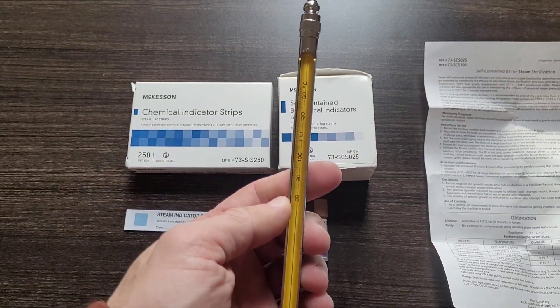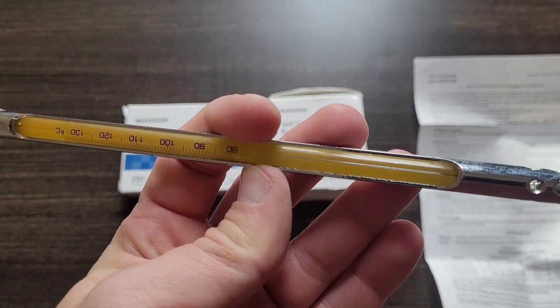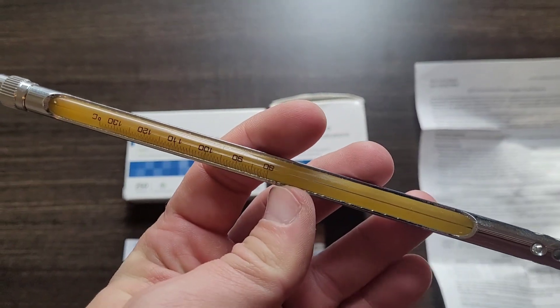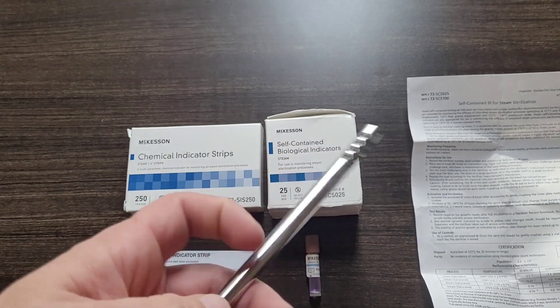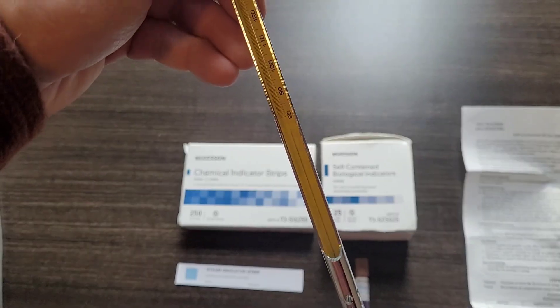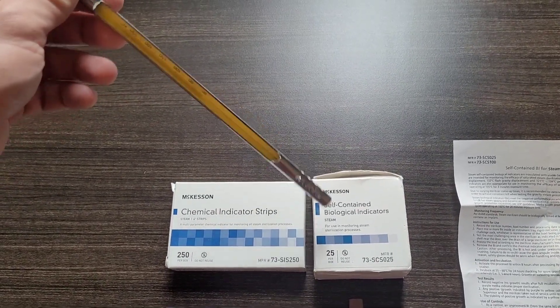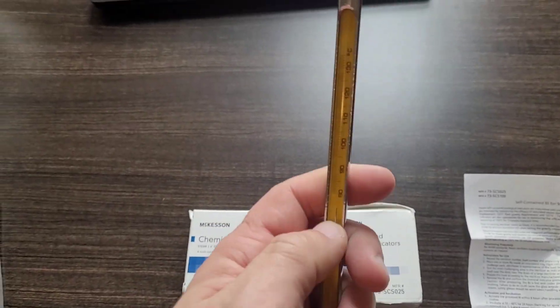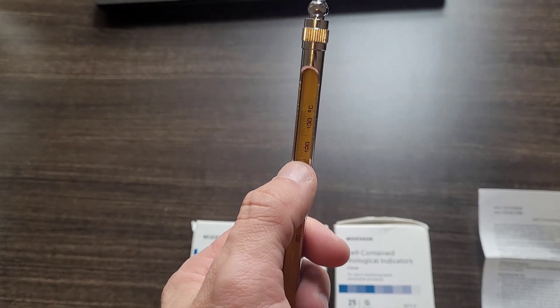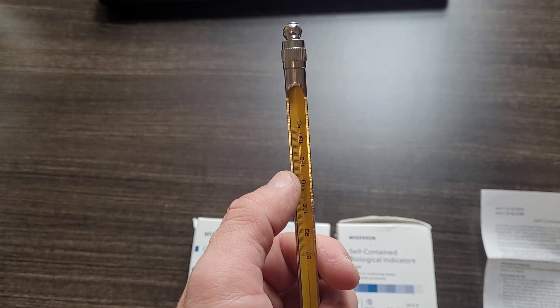This is a self-registering autoclave thermometer. It has a thin line of mercury in the middle. You shake down the mercury when it's cold and then place it at a 45-degree angle inside your autoclave. The mercury will climb and then stay at whatever the peak temperature was — that's how it self-registers.